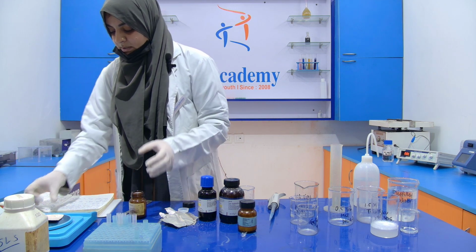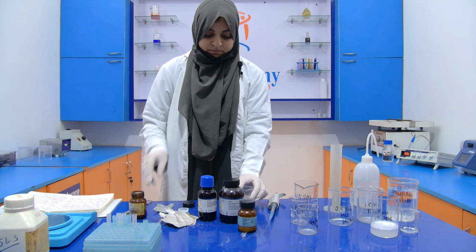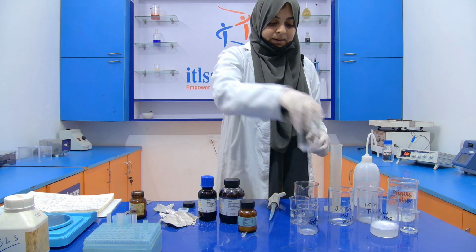Now it is 0.04. Now you have to add it into the 30% acrylamide solution. So our third chemical is also ready. It is 30% acrylamide.